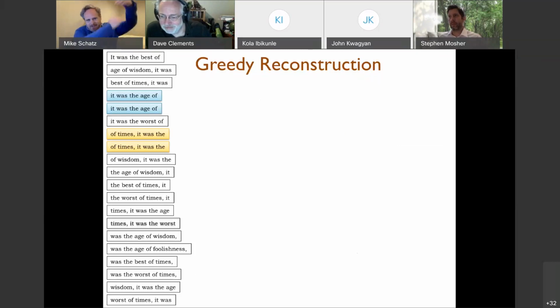Now we just have this big table of 140,000 fragments that we want to go through. What we want to do is take this big table and try to organize it and piece it together. If you've ever put together a jigsaw puzzle with little tiles, it's very analogous to this process.